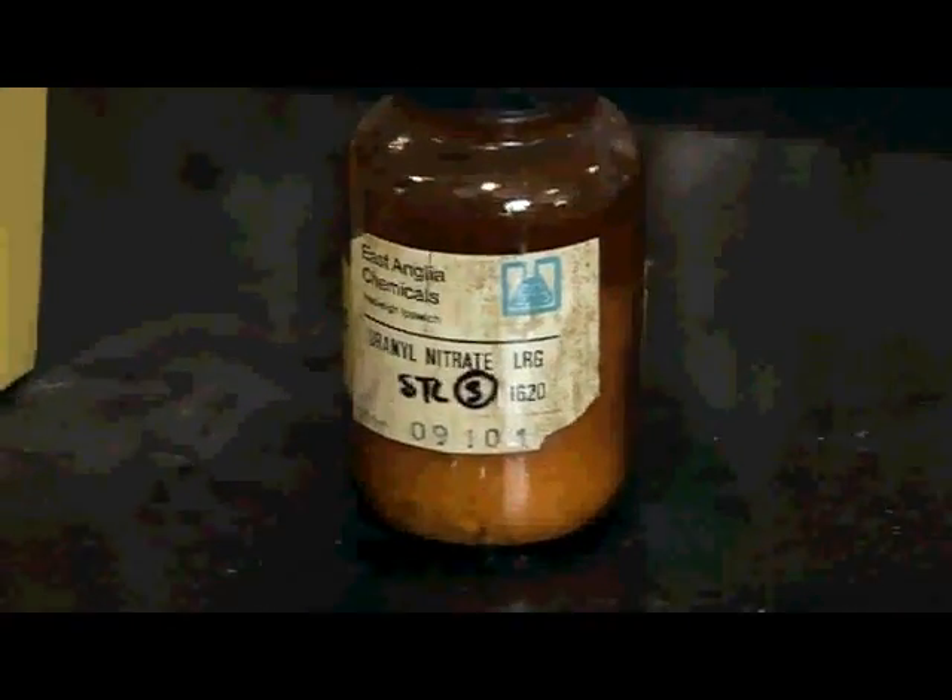But it's all very important, because you have to be certain that when you're handling depleted uranium compounds, you're not going to end up poisoning anybody, and you're not going to end up getting radioactive compounds all over the place. So we have logbooks, and we have to record how much we use and when, and how we dispose of it. We have detectors, which we have to sweep the lab with.